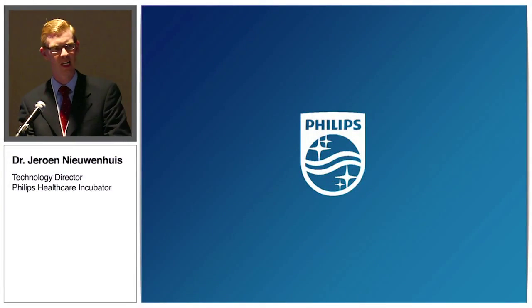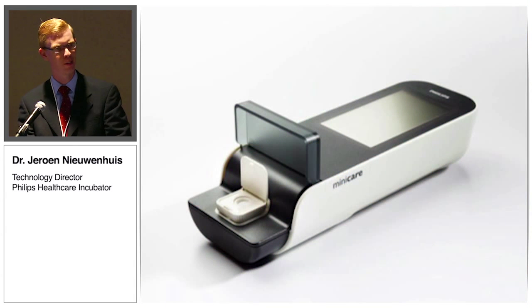So some of the important aspects that you can see in this system is that the microfluidics are very simple indeed. Once you add the sample, it is drawn in by capillary forces, and once the measurement chambers are filled, there's no more microfluidic action.